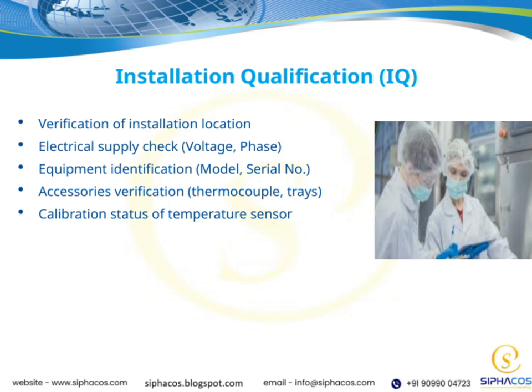All these points come together to confirm that the equipment is installed correctly, functioning as intended, and ready for qualification activities. Remember, thorough IQ helps us avoid issues later in the process and maintains our compliance standards throughout the project.